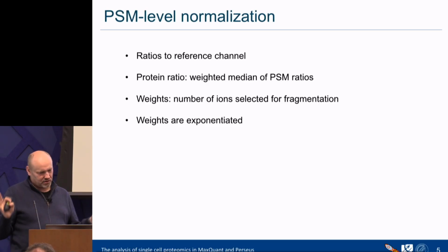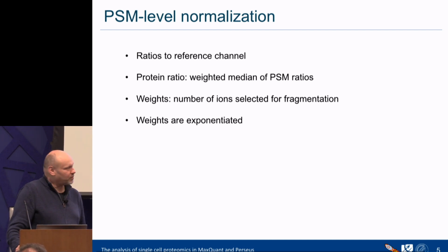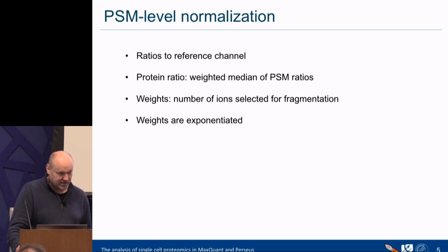Okay, so now we have more features, more TMT reporters to work with. So what do we do with them then? I'm only talking about proteins now, not PTM quantification, where you usually have a lot of PSMs, hopefully, that map to the spectrum. And then the obvious question is how to combine these quantities from the different PSMs.